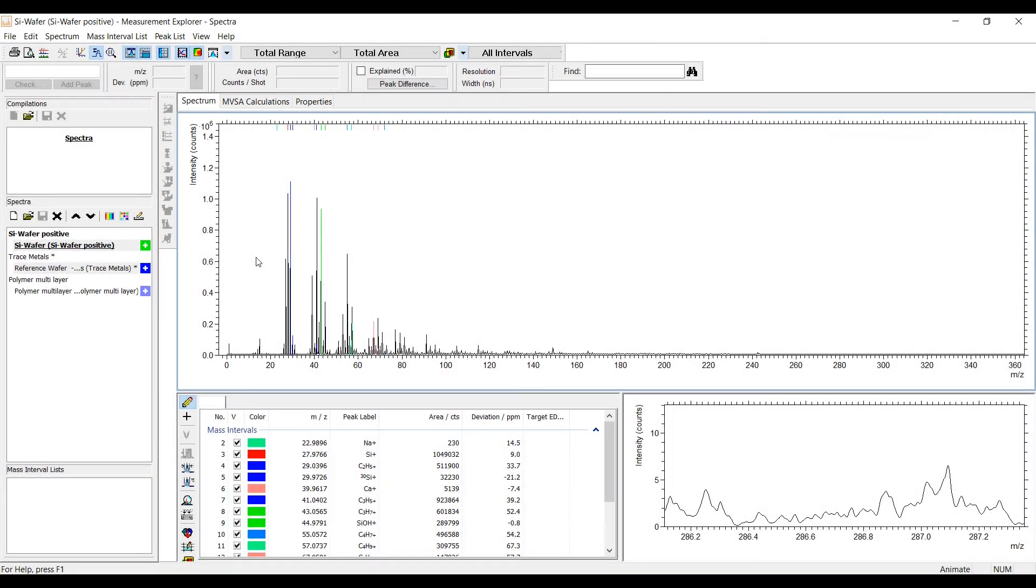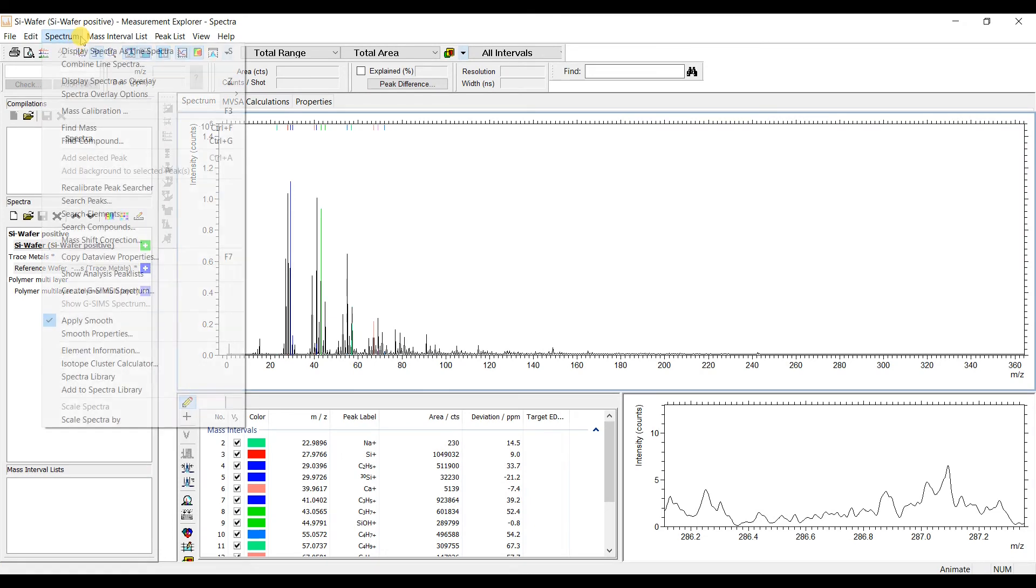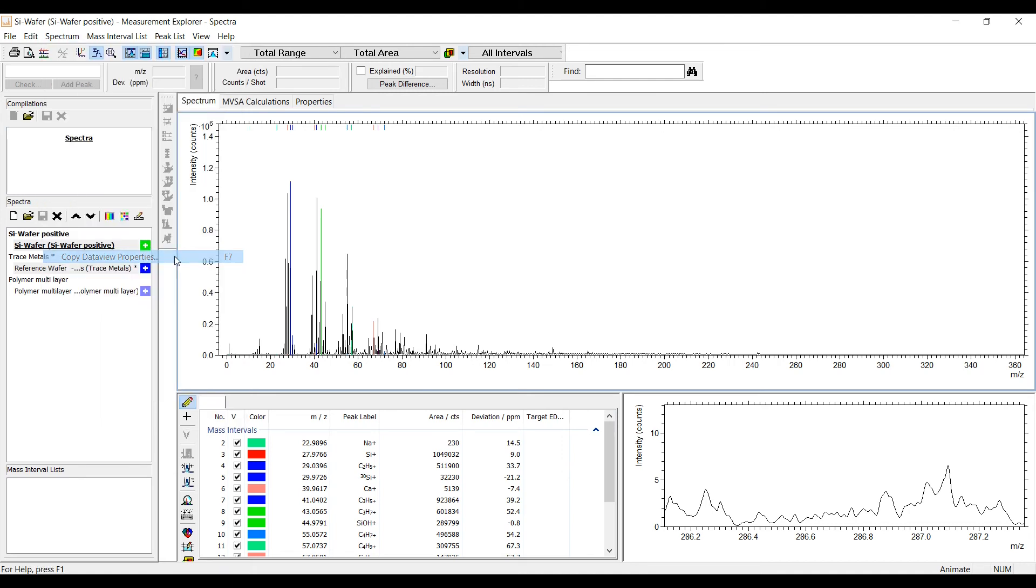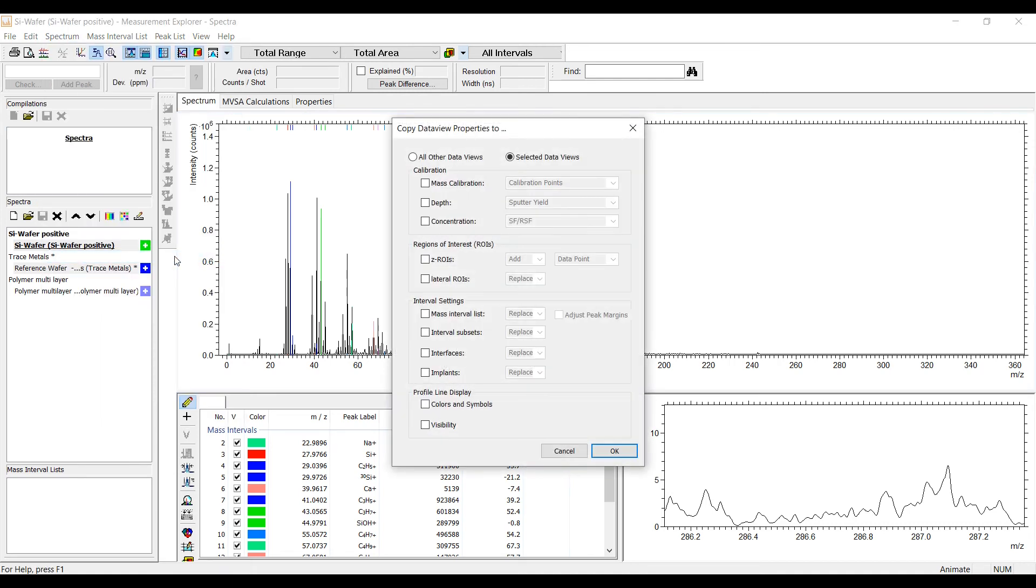A new dialog was established to bundle the transfer of data view properties to other data sets. You can open this dialog in the menu of each program or with the shortcut F7.